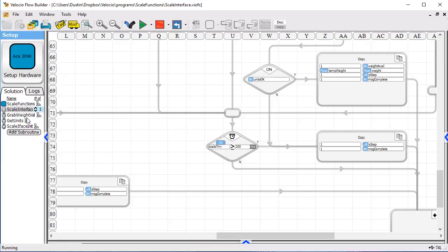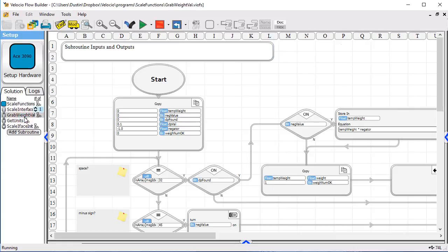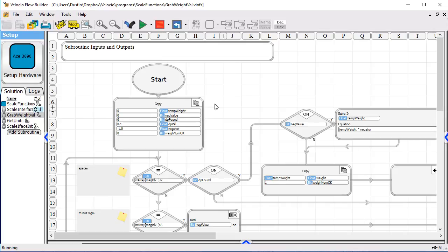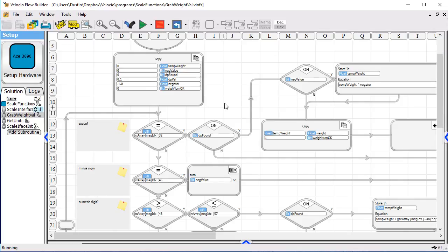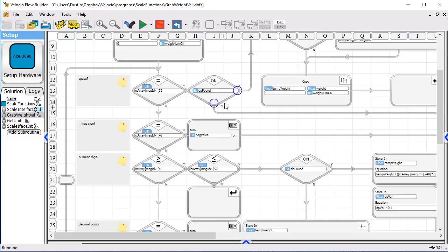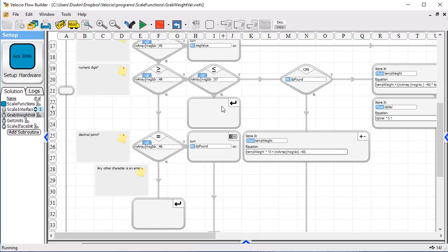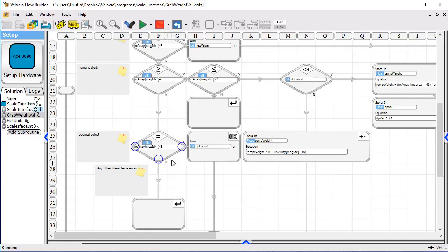I'm not going to go through all of the details of the decoding the weight and the units and so forth. It is here. You can take a look at it. It's posted on the website. But it goes through and it does an ASCII decode. It goes into a loop and it goes through each character. And if everything is proper, it builds the data response.